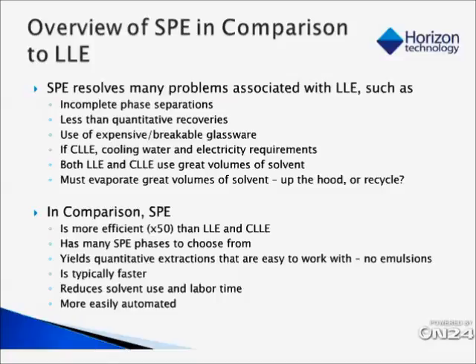SPE's been around for probably 40 to 50 years. And in that time, a lot of progress has been made. Certainly at the very beginning, back in the 1970s, there were a lot of things that were tried that didn't work as well as what you would find today. In fact, Corey Kelly from Phenomenex did a great talk at the National Environmental Monitoring Conference talking about the changes in solid phase extraction and the development of new chemistries and new materials that have really made it a very versatile and useful technique now compared to the early days.